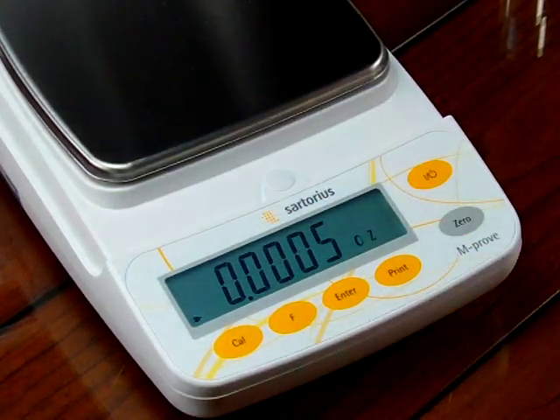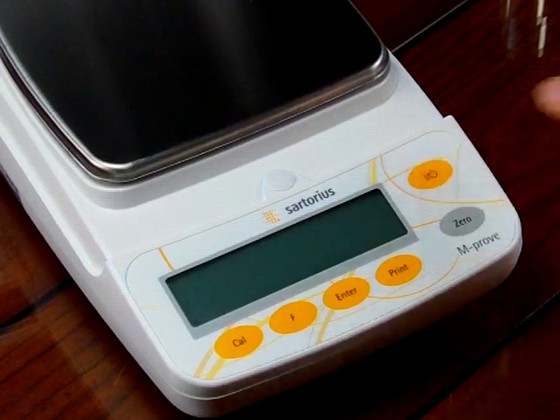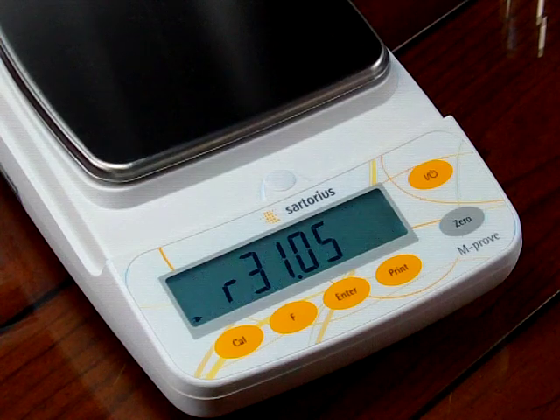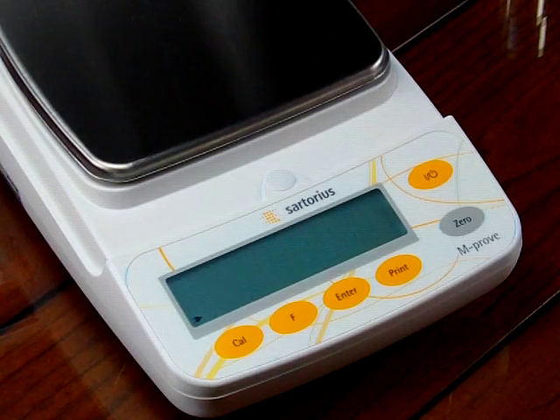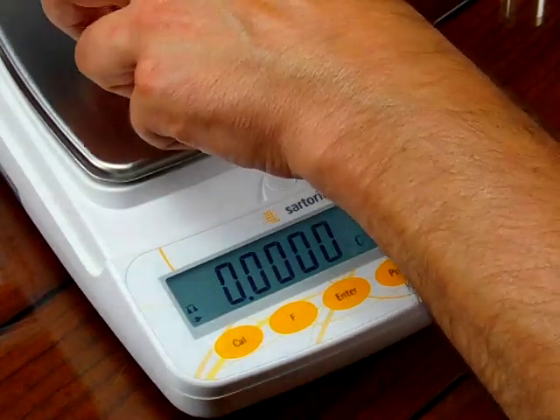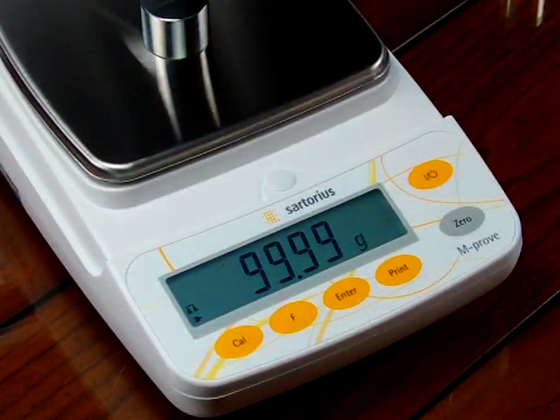One thing you'll notice is that when you're using the balance in the unit application, it is always going to power up in the secondary mode. So after turning the balance off and back on, we have it in ounces, and if I press the F key, we're in grams.